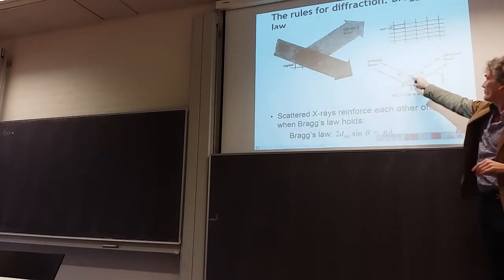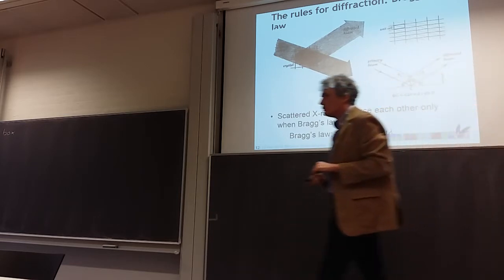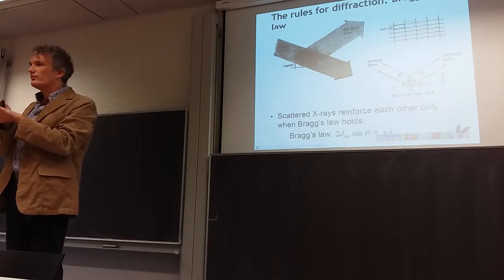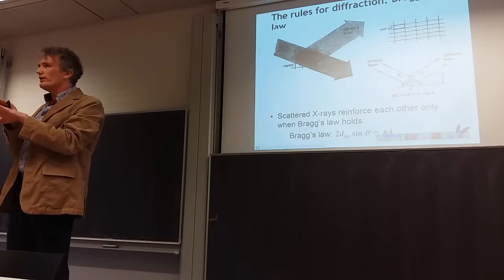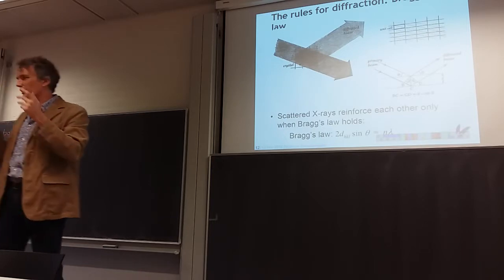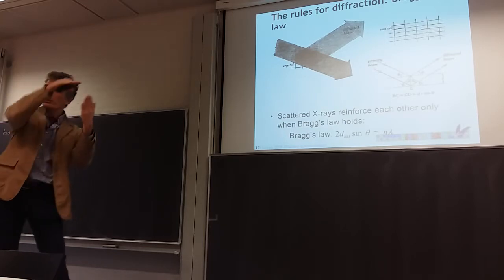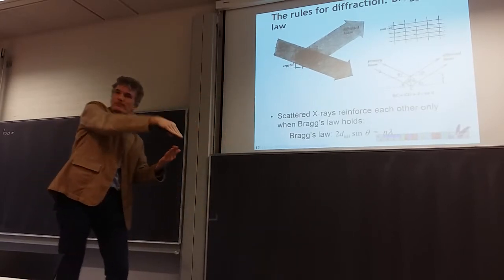So now, depending on the angle, you'll have a difference in how the different waves have changed after diffraction. Yes? Okay, now you know what two waves do when they meet each other? Ever, yeah, you get the sum of both, right? Ever thrown two stones in a pond? Yeah? That's what you should think of. Okay, so now they can be either in phase, so the sum is actually double, or they can be out of phase.